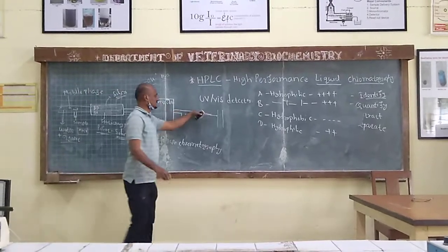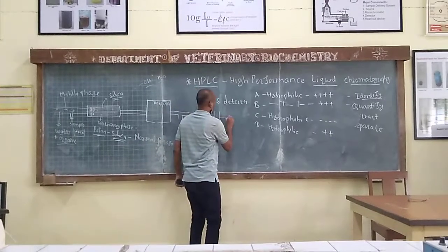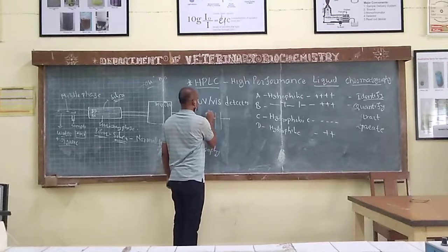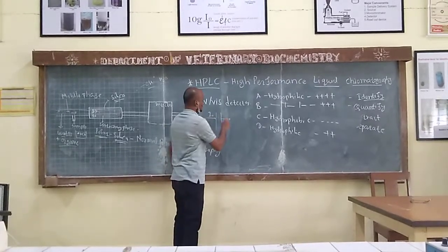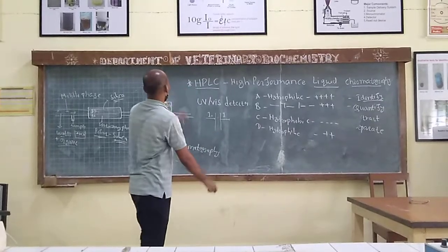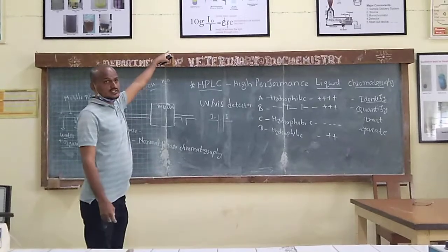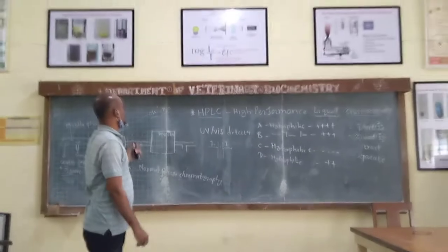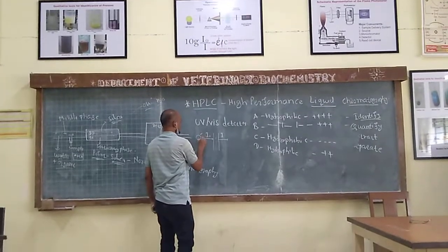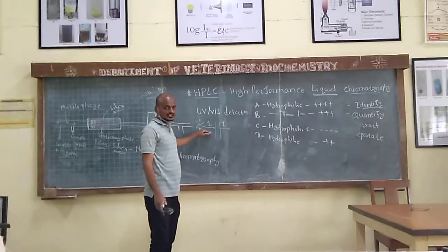So we are passing the beam of light such that it will hit this molecule and some light will come here. So this is our incident light I0. This is our transmitted light. Okay, so we have the equation here. Upside, if you see, we have the light source. So a bulb is there, flashing the light. Now this is the beam of light with I0 intensity.